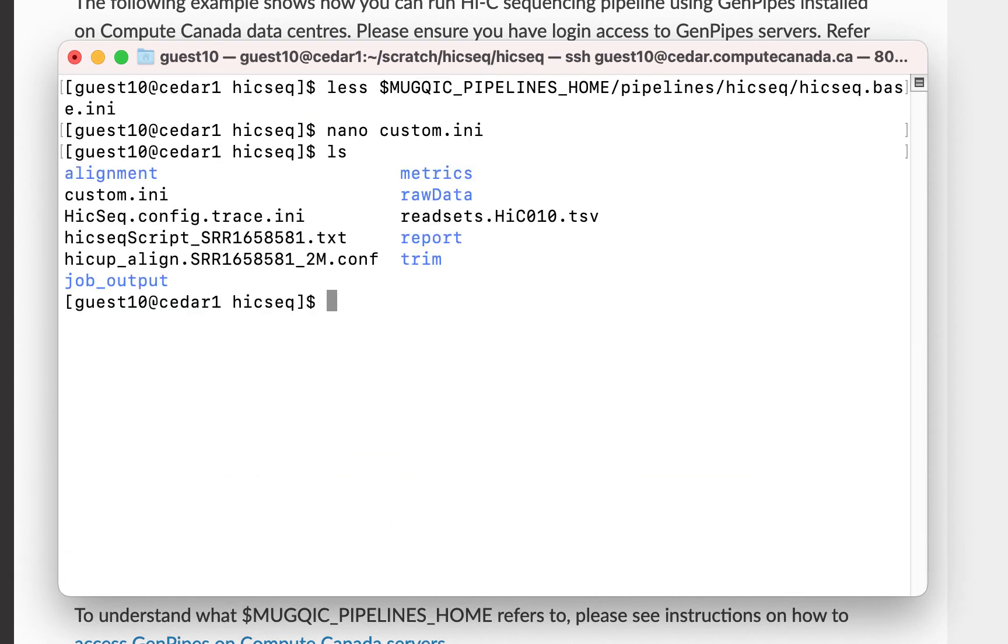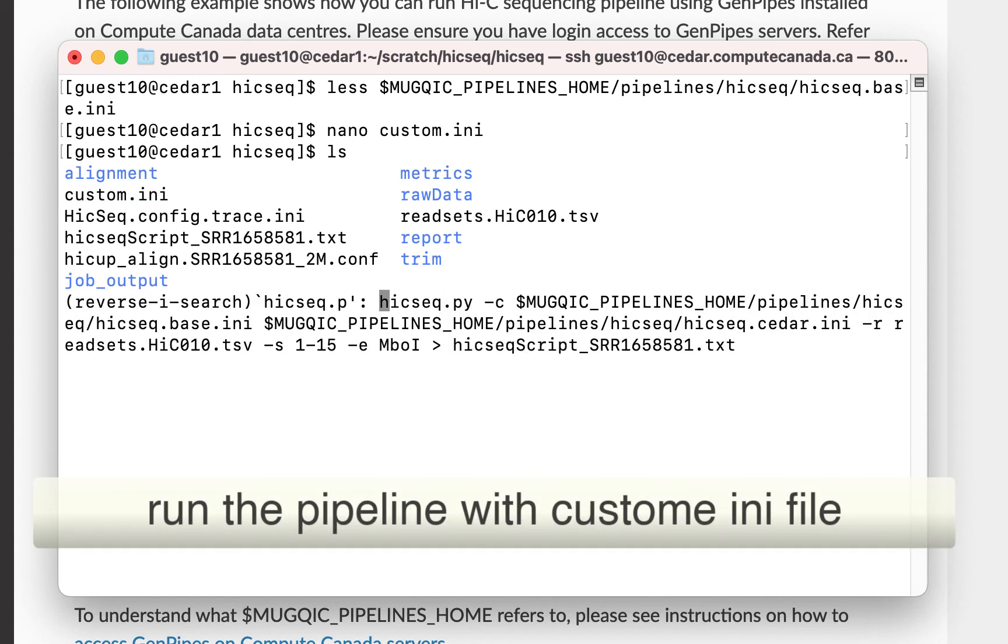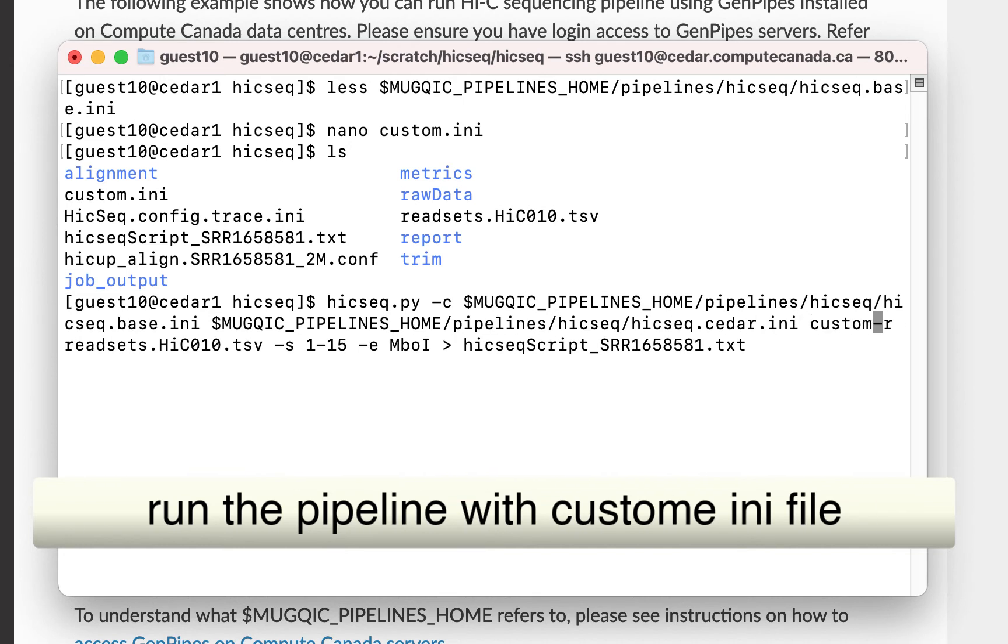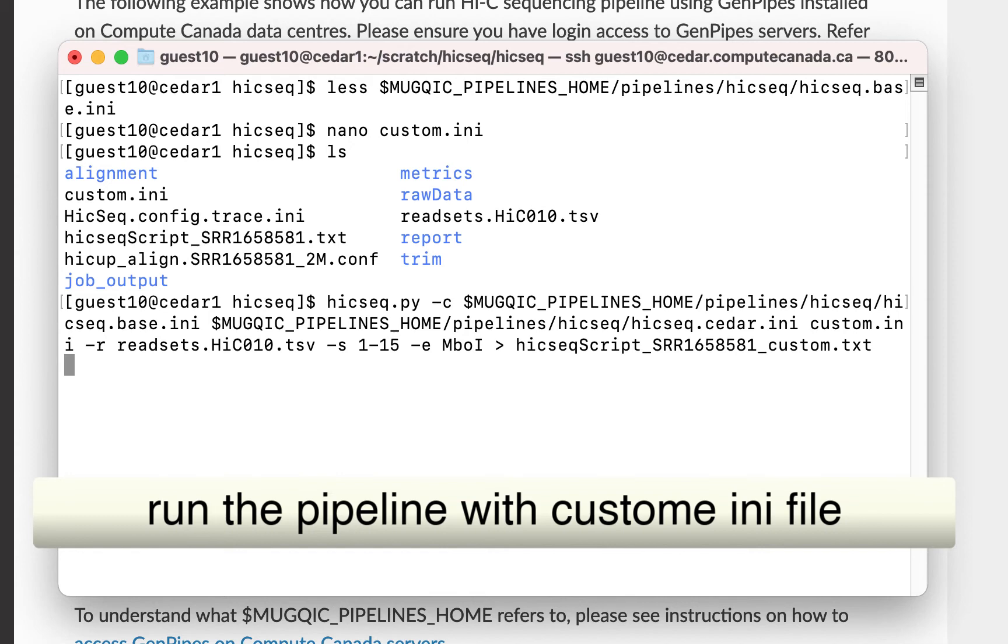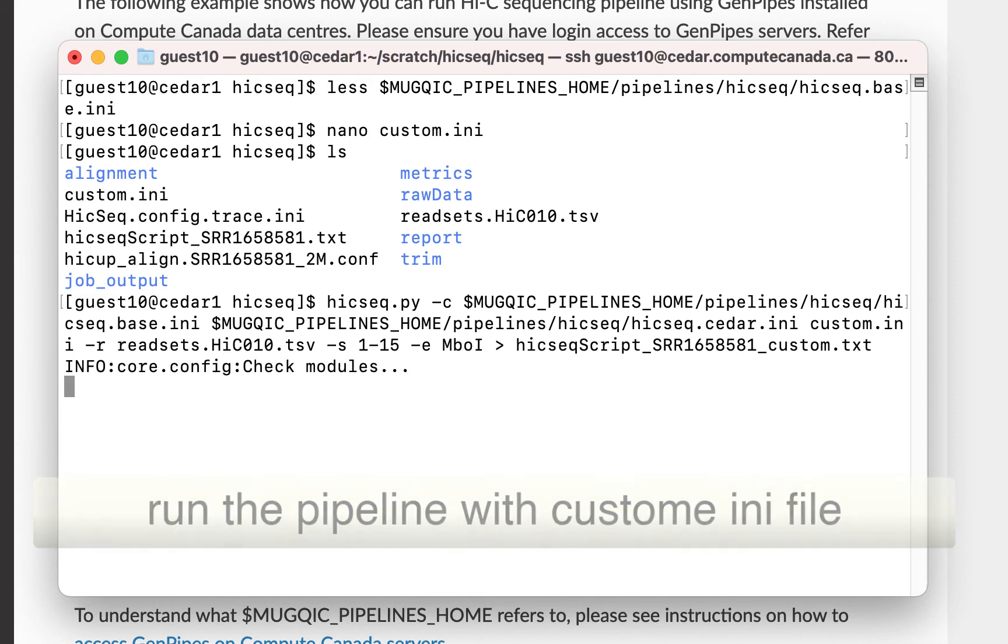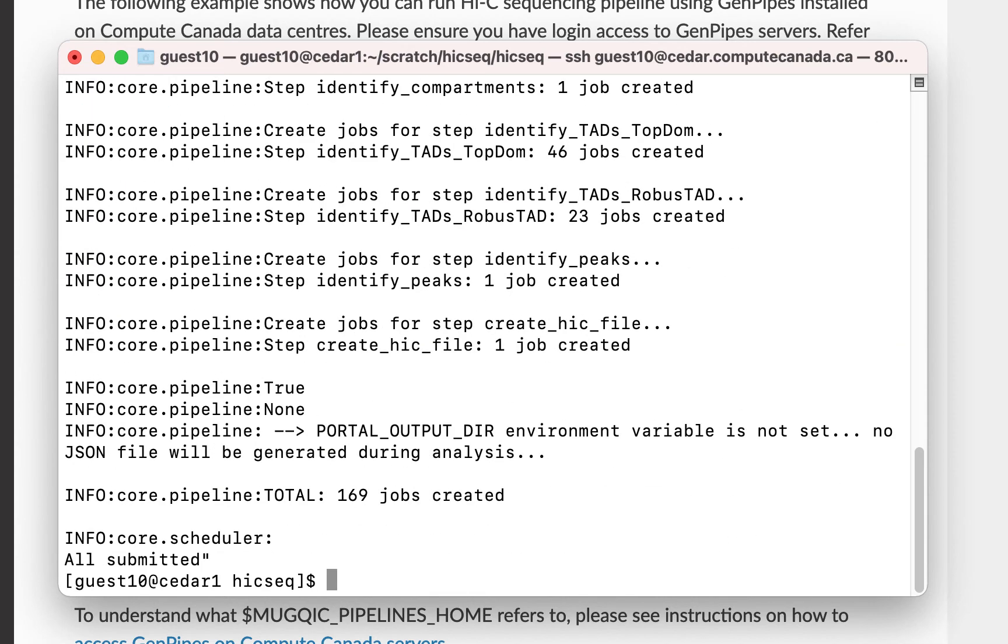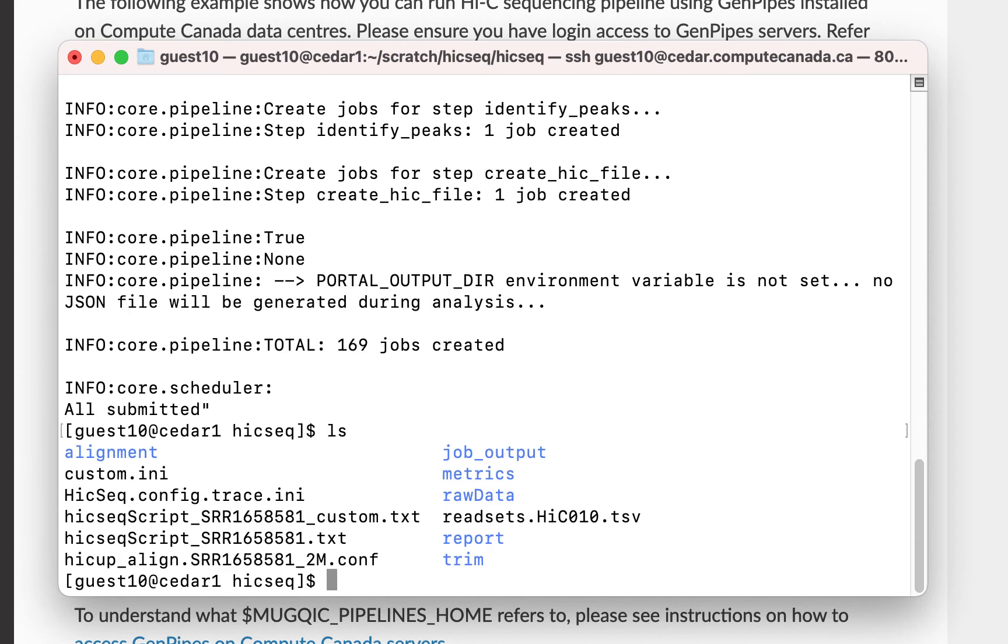Next, rerun the pipeline. Add the custom .ini file after the cluster specific .ini file. You can submit the jobs to the cluster like before and get the results.